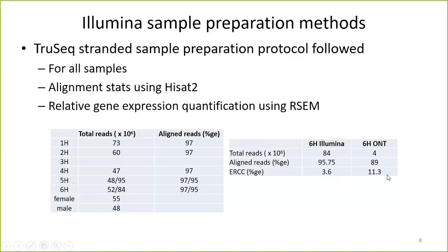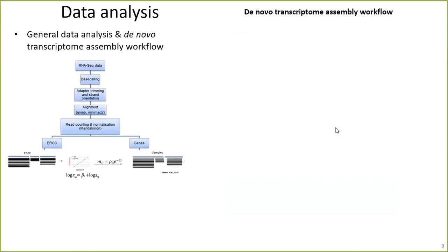So this is a summary of the data analysis workflow. This is the data analysis for the nanopore that I'm presenting right here. Sorry about that. So basically, we get to the RNA-Seq data.